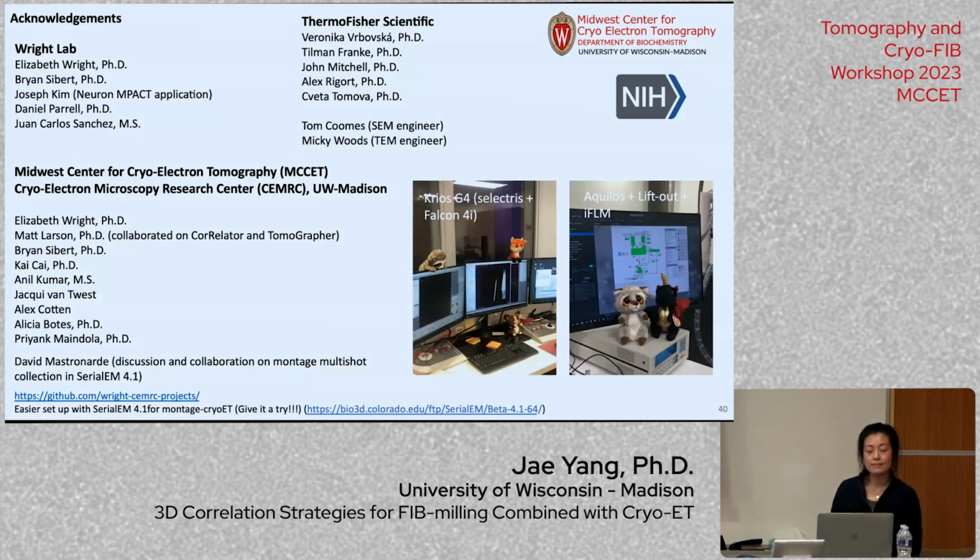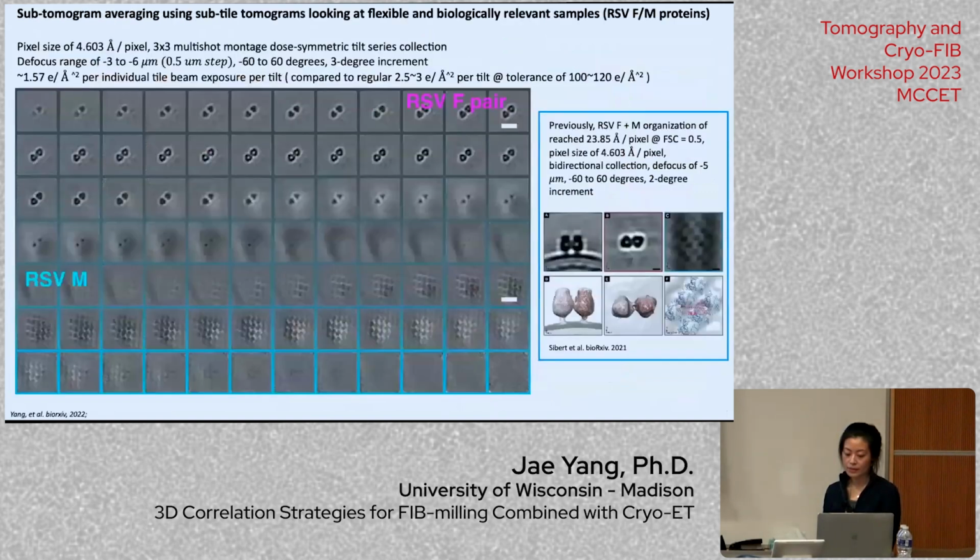How long does it take to go through the process of developing the correlation tool to do your pre-correlation, and then do the FIB-milling with iFLM, and then go into the microscope to collect tomography data? You didn't comment on the metrics for collecting something like a 3x3 array. Oh, okay. I think I probably, yeah.